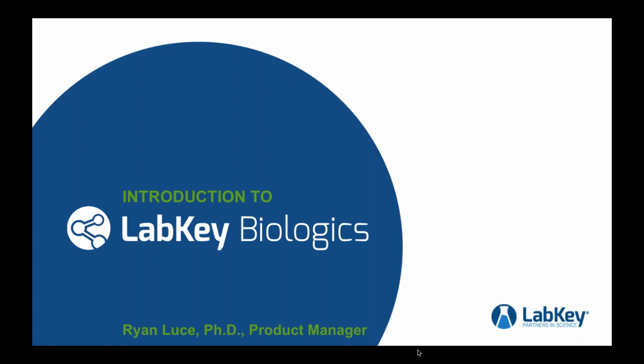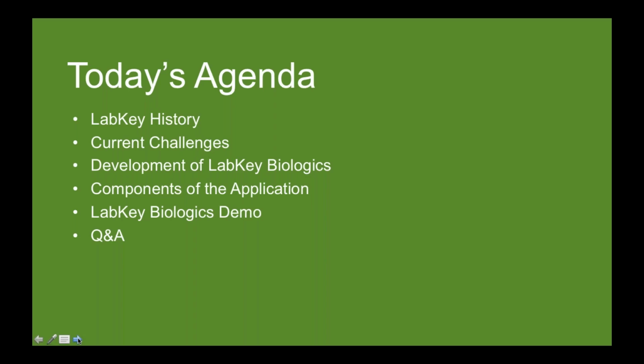What we are going to talk about today, first of all, just real briefly, I promise you, a little bit of history about LabKey and the development of LabKey Biologics. Current challenges that we saw within the molecular biology laboratory and what we wanted to address, how we went ahead and built the application, the various components, as well as a demo of LabKey Biologics, and again, that question and answer period at the end of the talk.